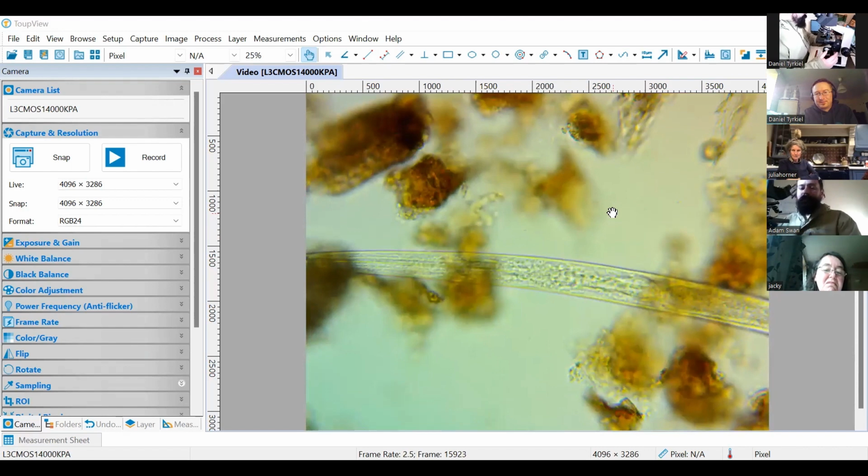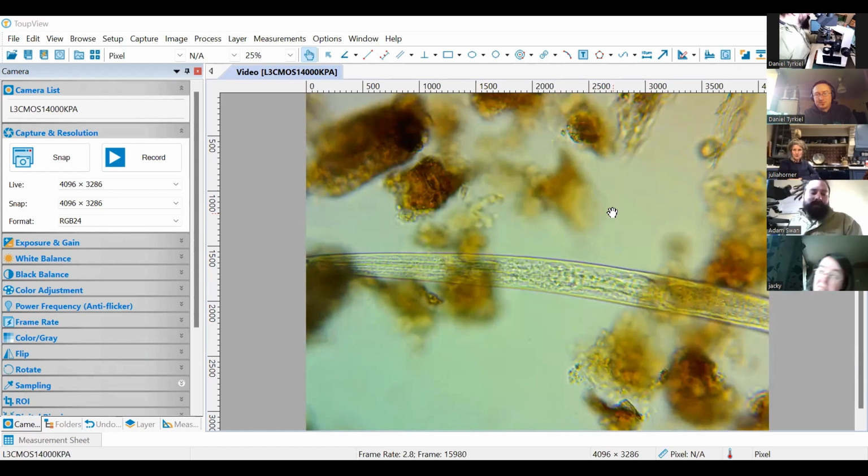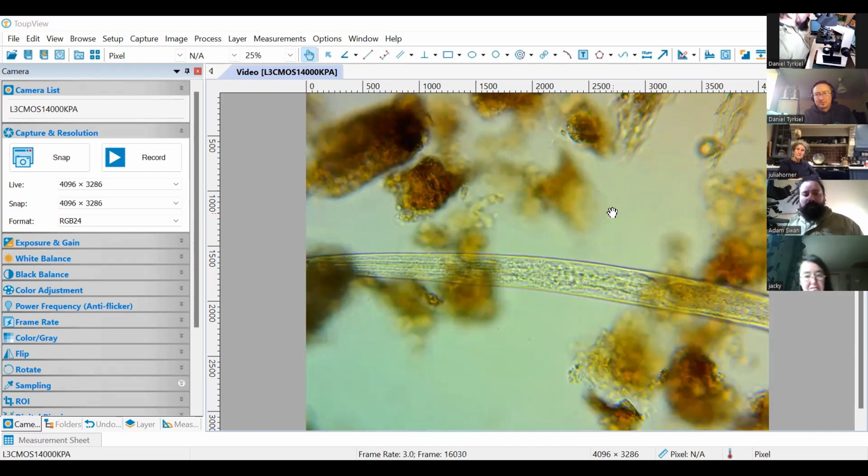It looks kind of different. Oftentimes, bacterial feeders are half the length of this one. Now, in the young piles, we try to get the levels of nematodes elevated. At the moment, those levels aren't so elevated, so when we extract them into our product, we get a lot more mature adults, and they seem to display different morphology. They look very similar when they're juveniles, but when they grow up, they start showing their differences.